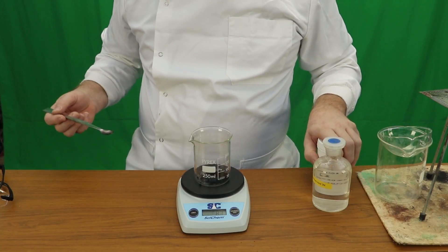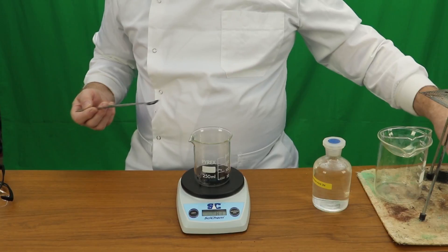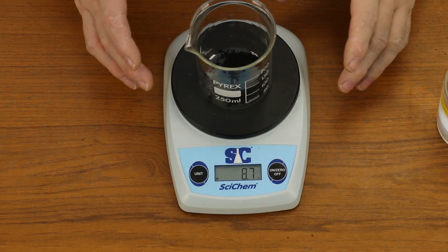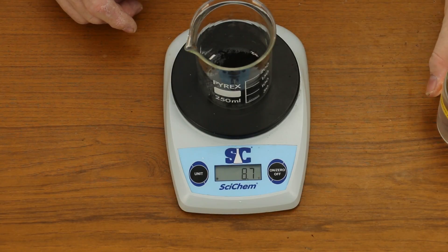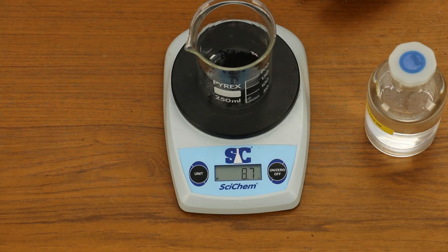I would put an extra little bit in because I want an excess of this. Now we need to measure out 50cm³ of sulphuric acid — and now we are going to get dangerous — so I am going to put my safety specs on.